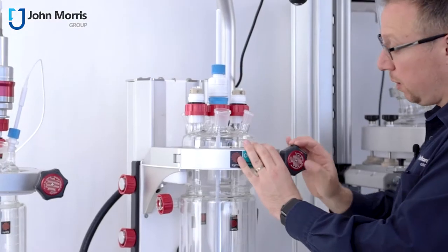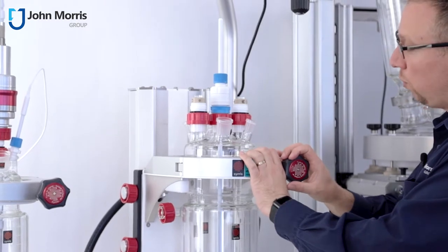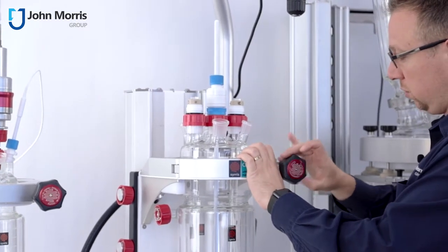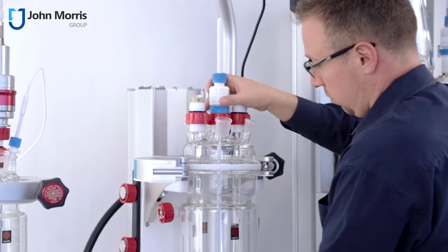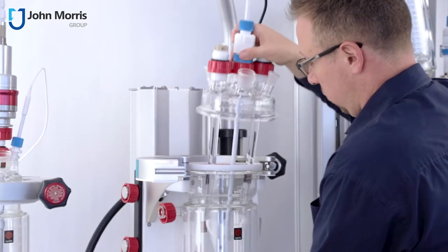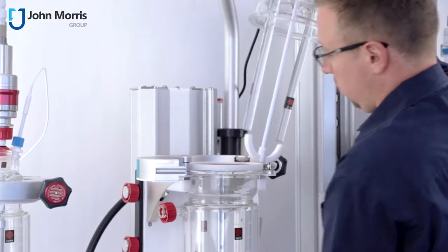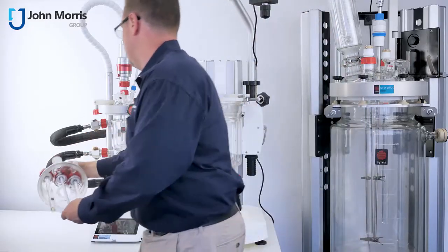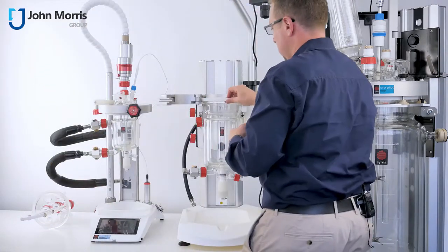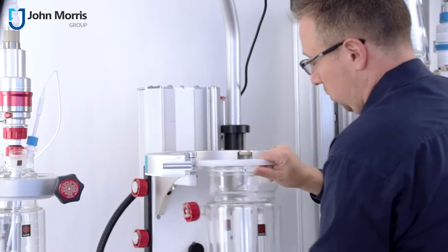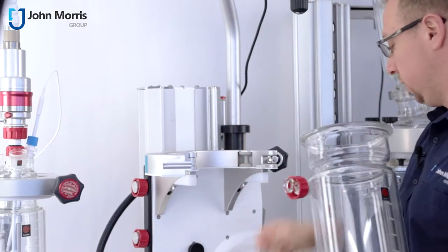What I'm going to do is open it up to show you how easy it is to remove all of the components. Place that one over here and straight out with the vessel.